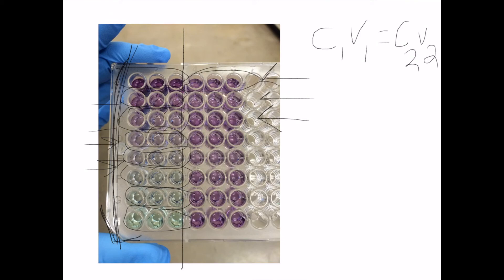And with a BCA assay, you'll usually want 100 microliters of each sample at least so that you have enough to perform three replicates here from the same tube of solution.